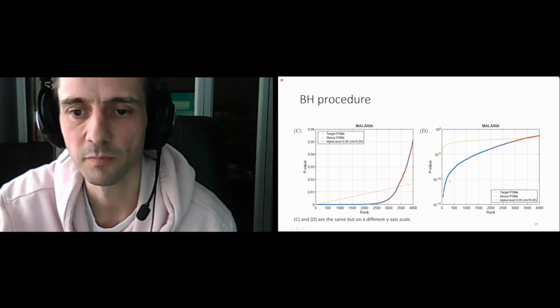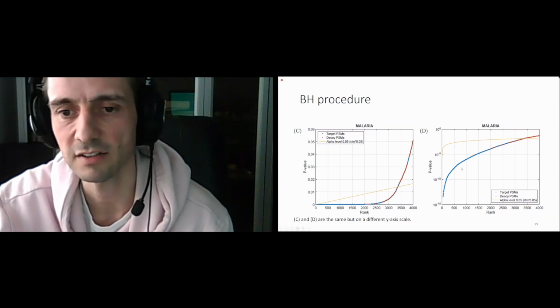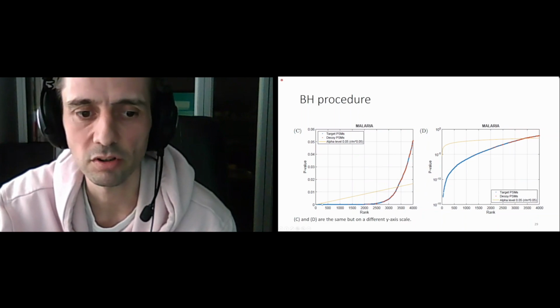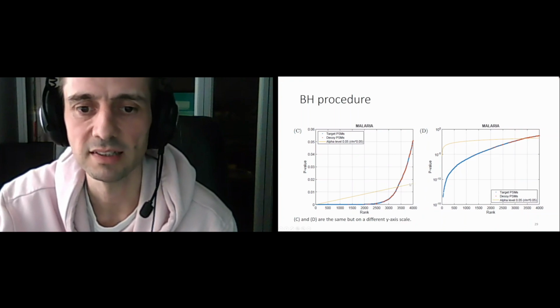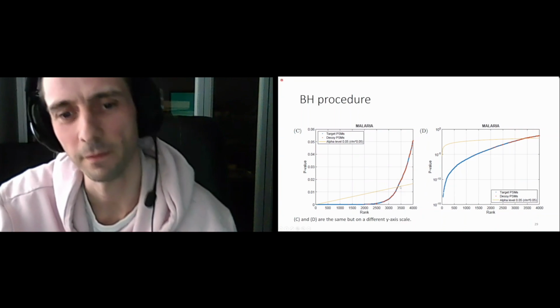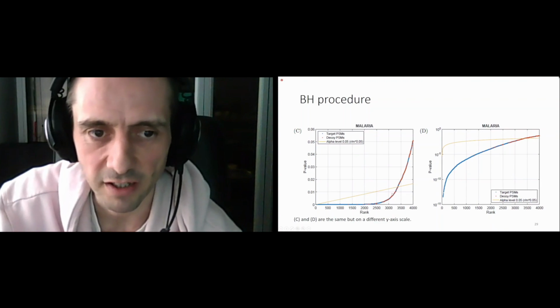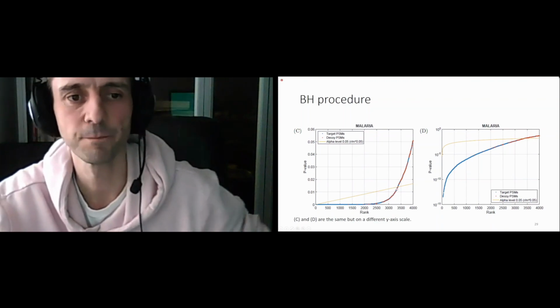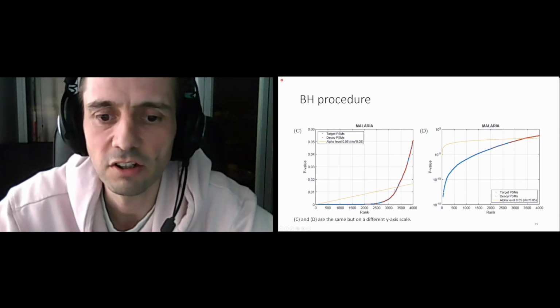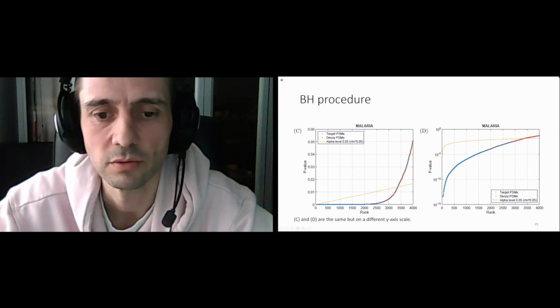we could accept. Now, in the Benjamini-Hochberg procedure, we want to control the false discovery rate at a certain error rate. So we can plot a line. This is kind of a decision line. Okay, and then in this example, it corresponds to the alpha level of 5%. Okay, so all spectrum annotations which are below this line are accepted or trusted. And then the incorrect annotations here have a 5% ratio. So this is how it looks.